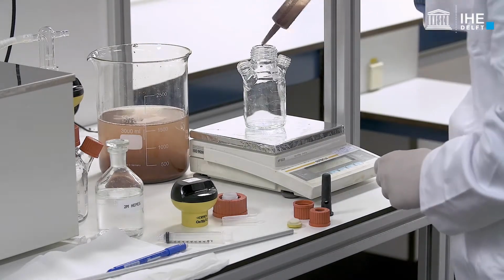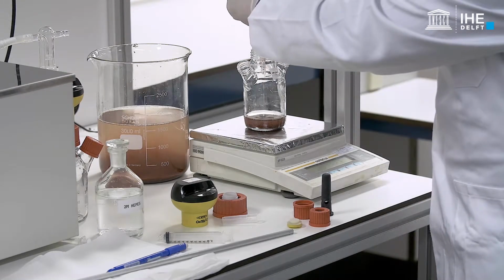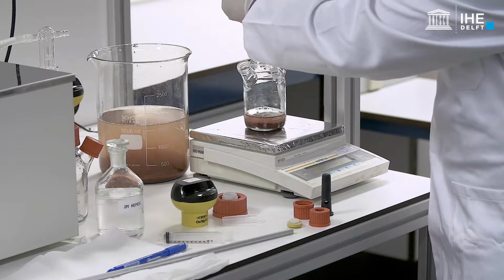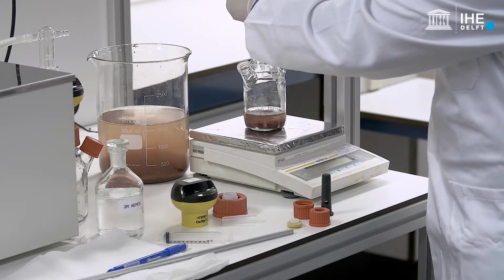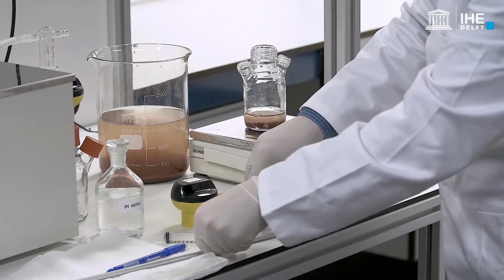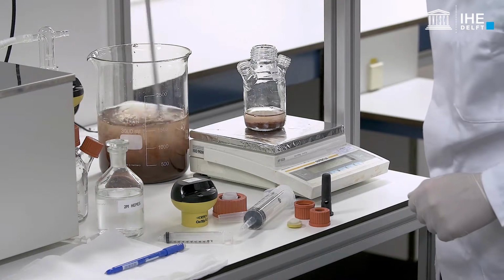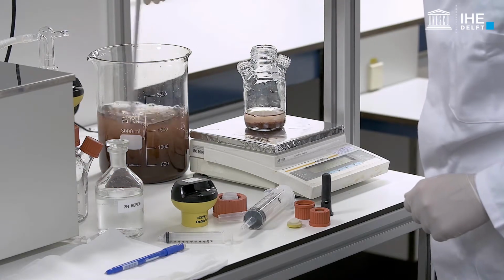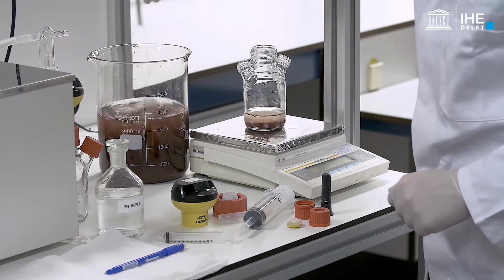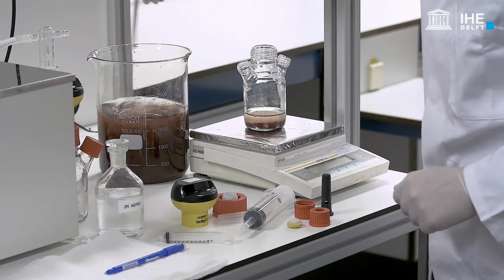Then transfer a known volume, in this case 0.2 litres, into the reaction vessel. A balance can be used to know the precise volume of the mixed liquor added. It can be assumed that the density of the sludge is similar to the density of water and thus can be considered to be of about 1 gram per millilitre. Repeat until the required volume of sludge is transferred.